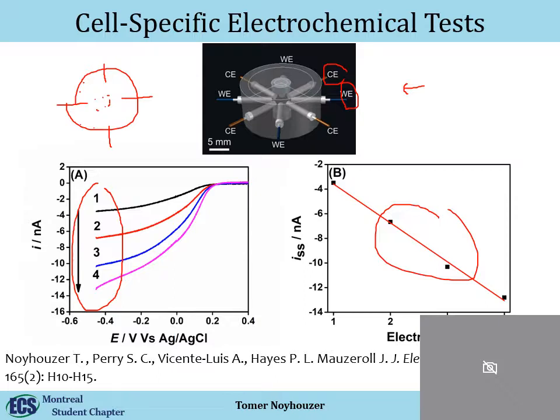What you do need to think about is that, let's say your working electrode is a 10 micron platinum electrode. If your counter is also a 10 micron platinum electrode, then the size of your counter and working are pretty much the same. So in this case, you might think about using a 25 micron as a counter, just to decrease any problems in your system. And again, I'm just saying it because you always need to remember that your counter has to be the same size or bigger, and you would prefer that it be bigger than your working. So that was one mistake that I made in the first protocol that I improved by just changing the counter size.